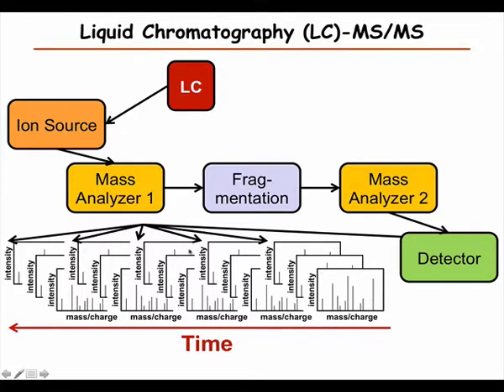What you will see later in the exercise, there are the two data files. They contain a lot of spectra. It's easily possible, in maybe a 2-hour data collection, to collect 50,000 fragment spectra.